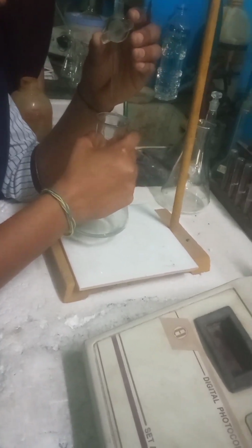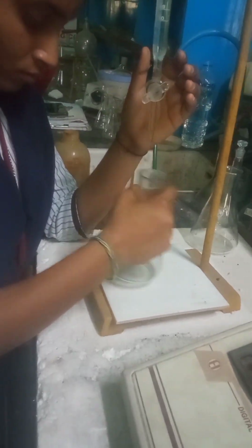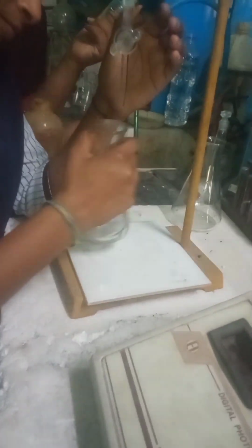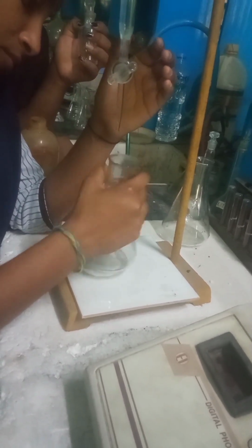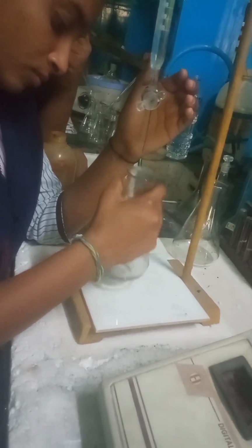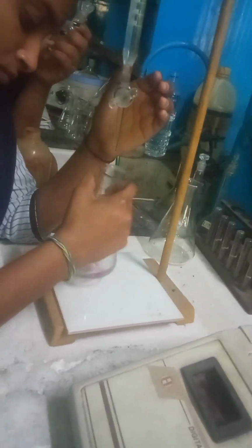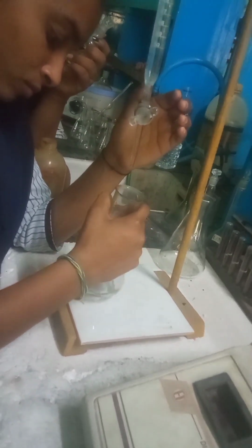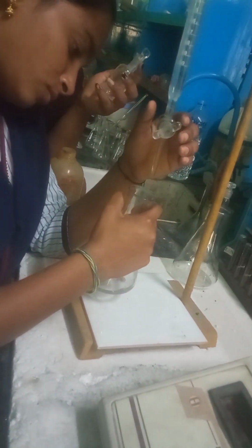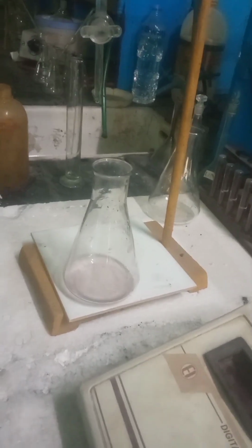After deriving the intensity of adsorption, that means X by M, one can plot a graph by taking the X by M value on the y-axis, that means intensity of adsorption on the y-axis, and the mass of charcoal taken in the flask on the x-axis.